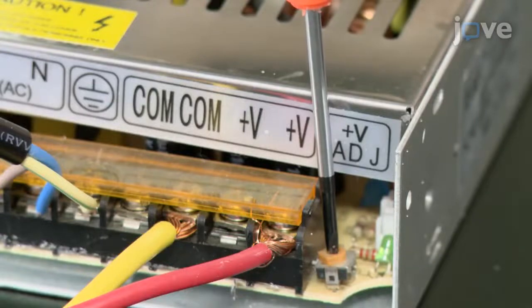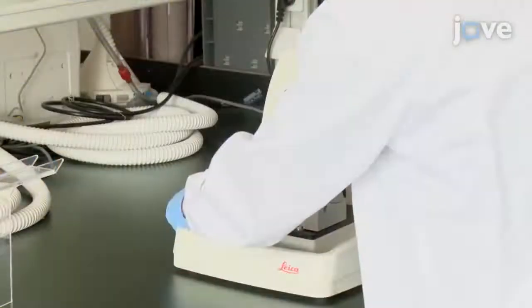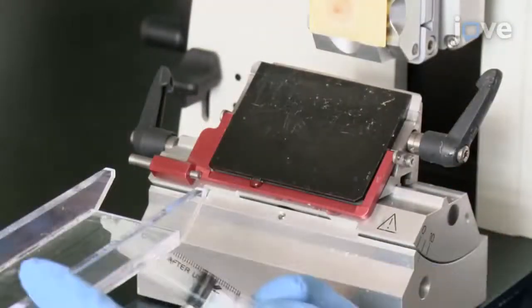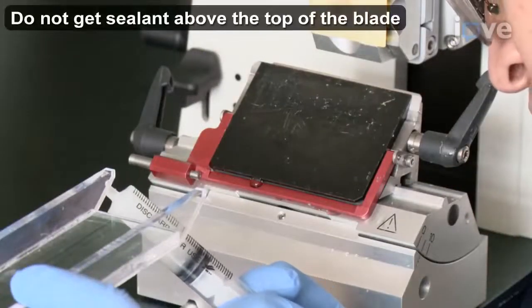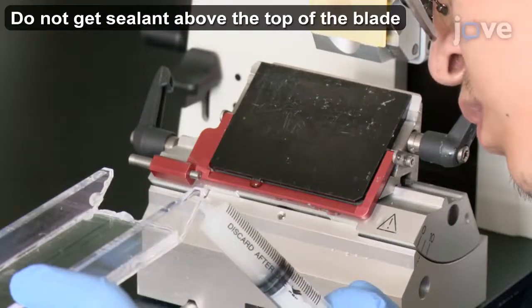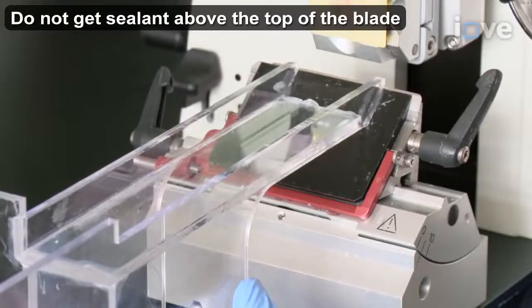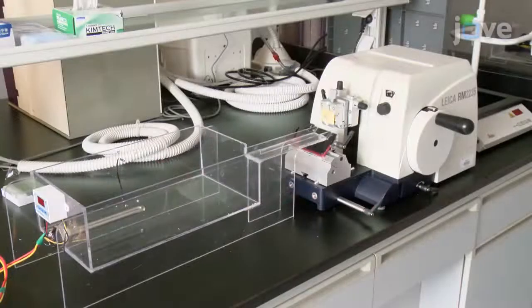Adjust the voltage so that it is below 24 volts before turning on the equipment. Remove the section waste tray from the microtome. Next, use neutral silicone sealant to link the section's channel to the microtome blade holder, making sure not to get any sealant above the top of the blade. Let the setup dry overnight to give the chloroform and neutral silicone sealant time to solidify.